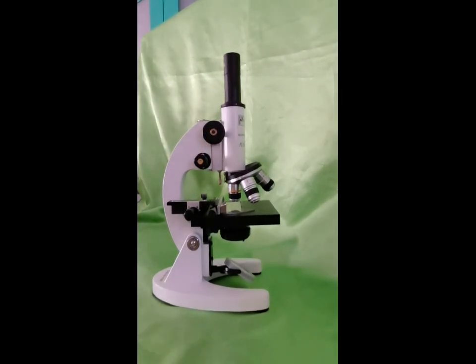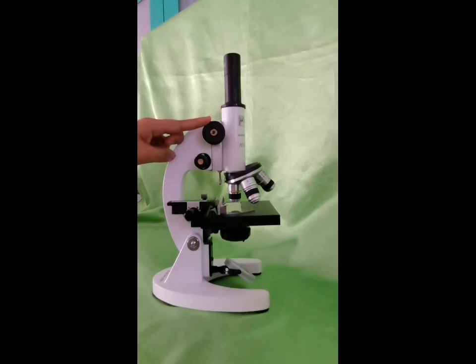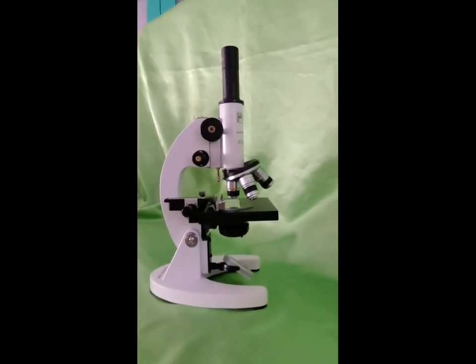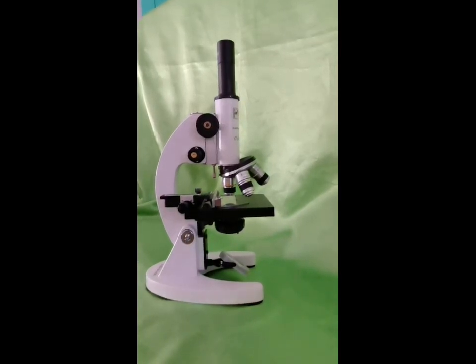Next is the fine adjustment knob. It is the smaller knob compared with the coarse adjustment knob. It is used for slow or little movement when focusing the HPO or the high power objective. It is also used to get a sharper focus of the object under the LPO or the low power objective.